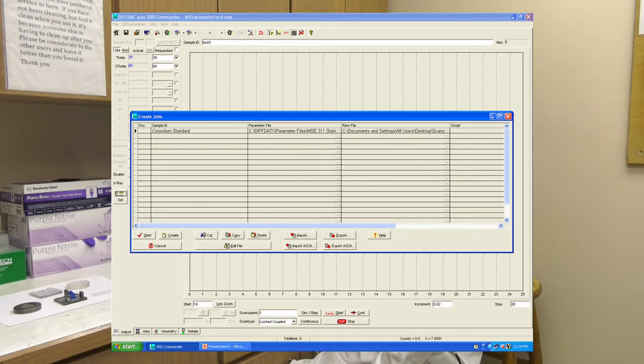This will open a new window where the user can add a sample ID, select a parameter file, and save location for their sample. The user starts the selected scan by pressing the Start button.